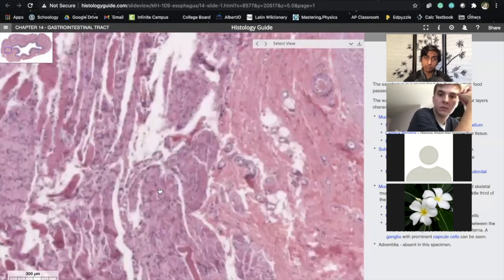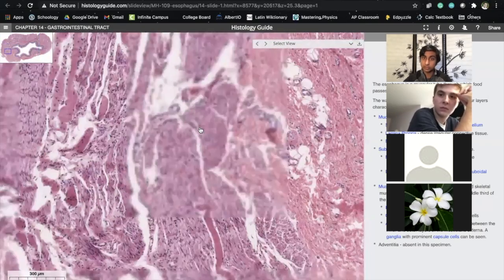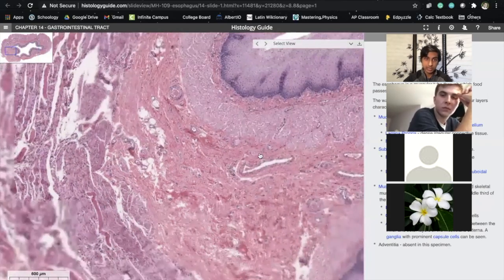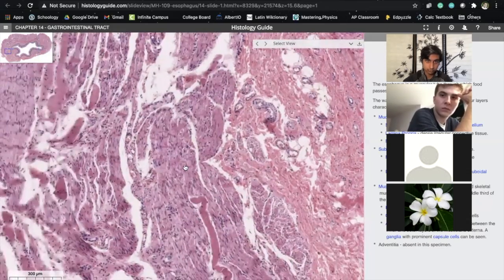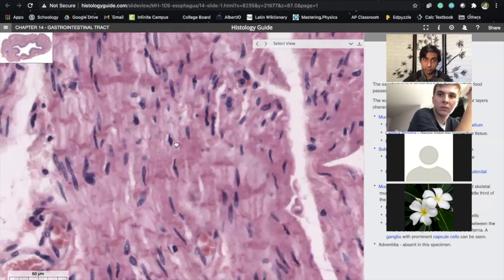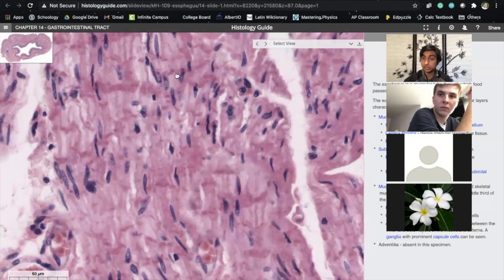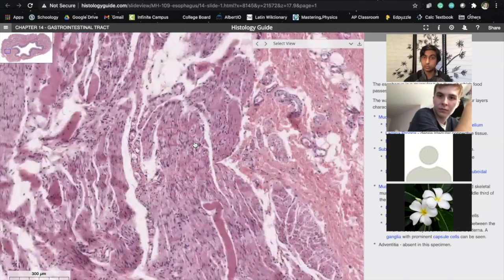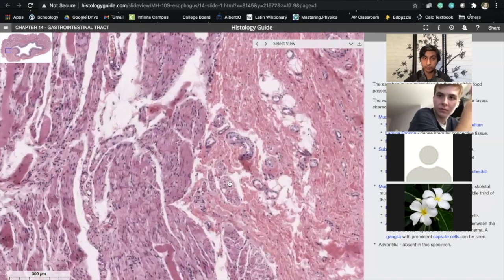And then you'll see again the muscles around here, and maybe you've heard the term striations on the muscles. You'll see how these nuclei are elongated, and with that comes the cell wall, the rest of the cell that's very elongated. And that is a mark of the muscle cells. That's something you can always look for when you're looking for muscle cells.